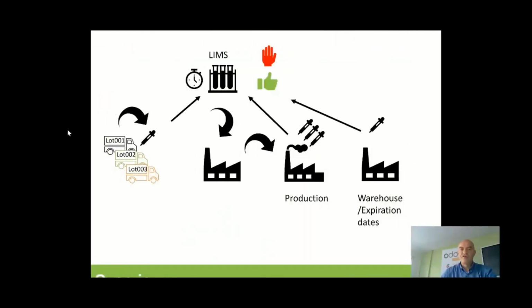Okay, so we saw during this presentation very quickly the integration between the LIMS Biologica Soft module and the Odoo ecosystem. So we saw that it is possible, in fact, to put some controls on any stock move, manufacturing order, or QC. So in our example, we saw the reception of goods, the possibility to take a sample, to analyze the sample, and to link the sample with the quality check, pass, fail mode, of course, and you have all the functionalities of Odoo quality controls to set a default and to record the corrective action.